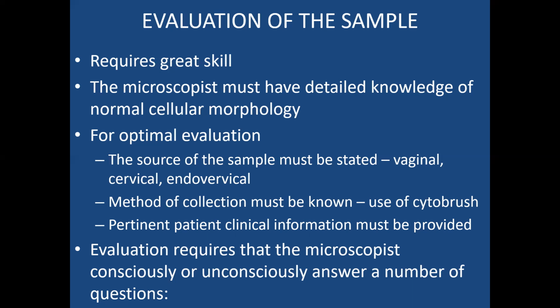So it's important that the source of the sample must be stated, and it's not all the time that the smear will be from the cervix. Method of the collection must also be known, whether they use the Ayre spatula or the cytobrush. Of course, pertinent clinical information must be provided. It's very, very important because screening is always done in light of the clinical information.